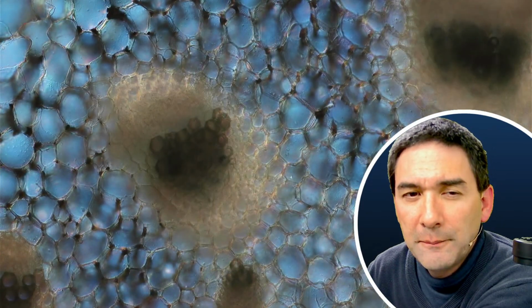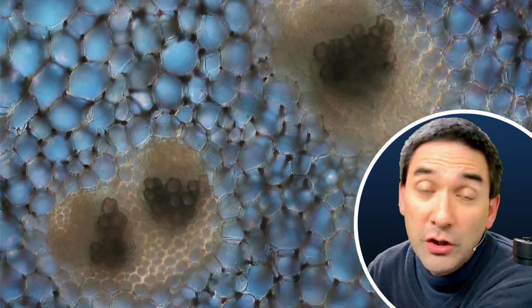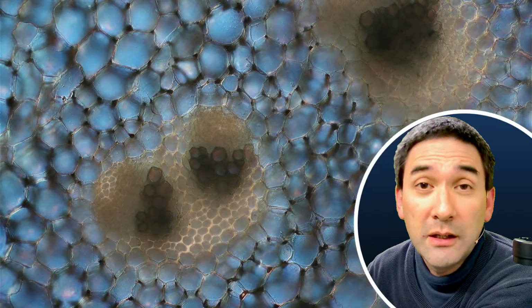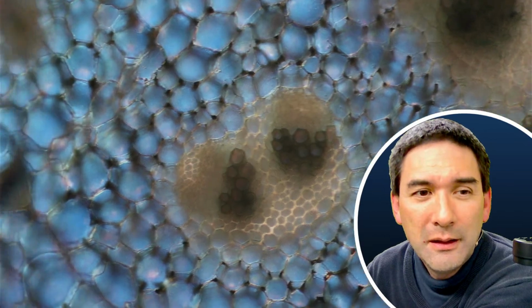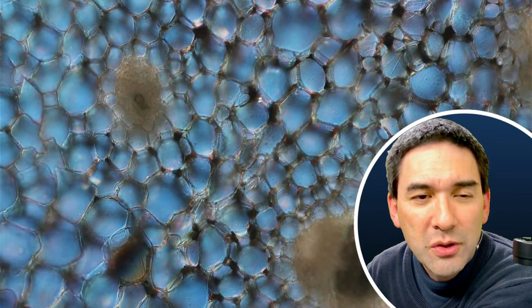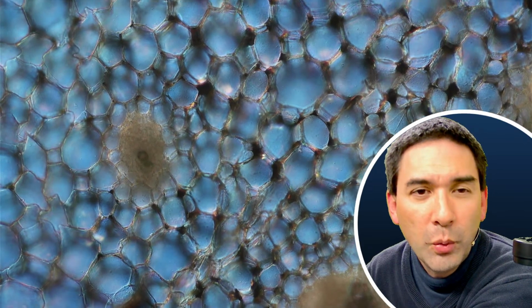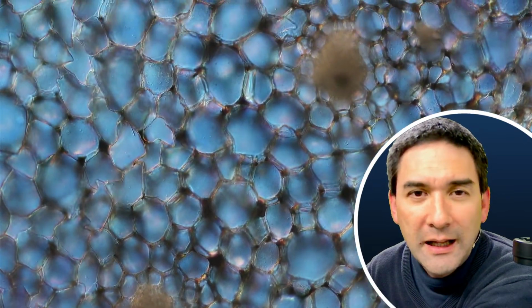Canada balsam apparently has the advantage, I've never used it myself, of extremely long-term stability, but it has the disadvantage that the sample must be completely dehydrated. This means you also have to work with organic solvents, first alcohol to remove the water, and then xylene to remove the alcohol again.